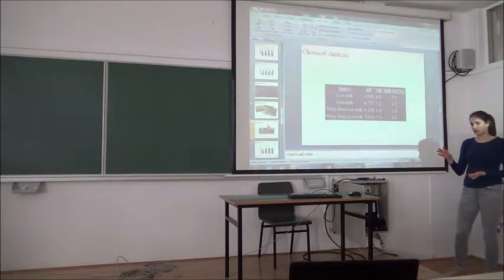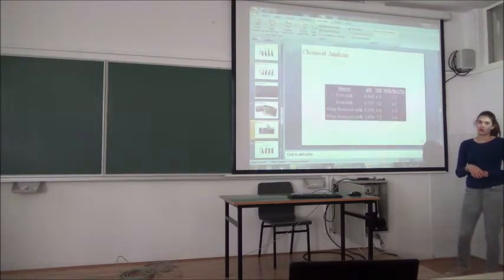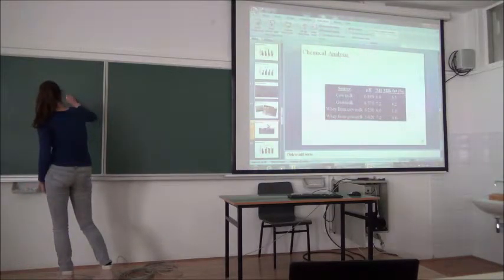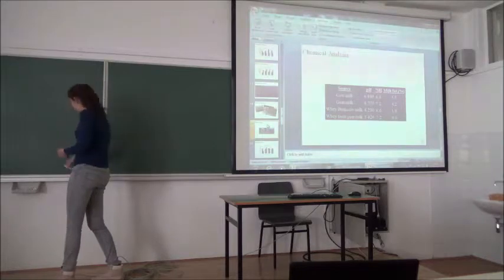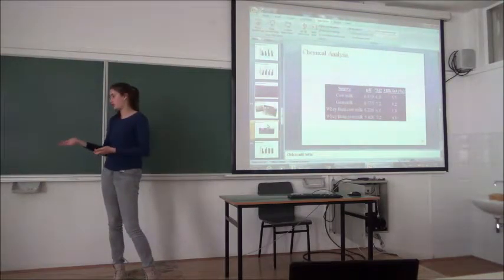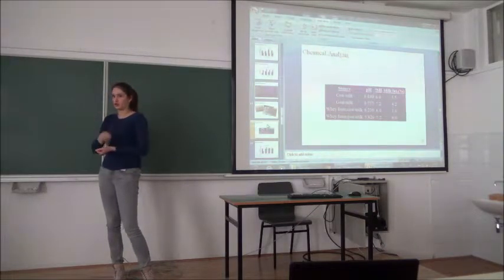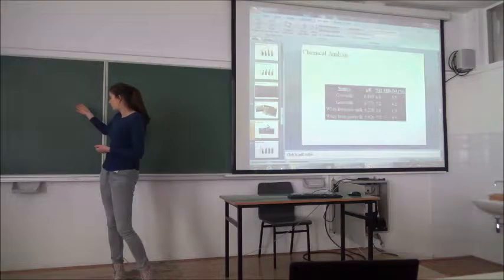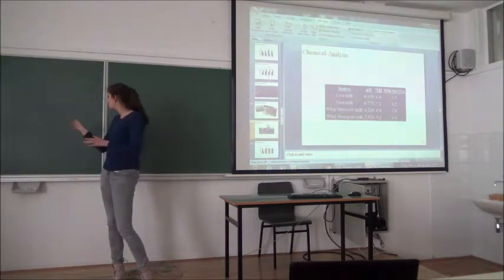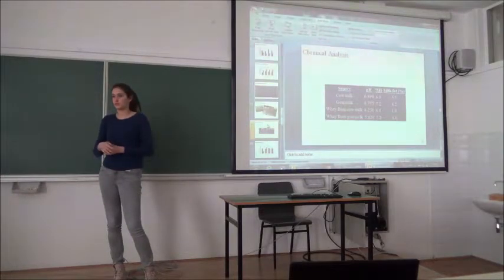We took some milk and then we put some phenolphthalein in it. Then we put some... Can I write it down? I'm not sure how to spell it in English. Okay. Then we use that. And why? Because it is the opposite of the acid, and the phenolphthalein will react with this and change the color. So we used enough amount of this to change it. Sorry, it will change its color to purple. Okay. Time's up.